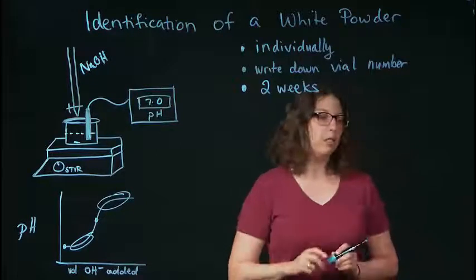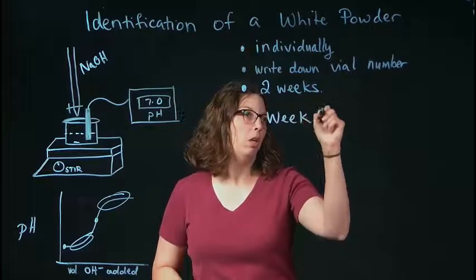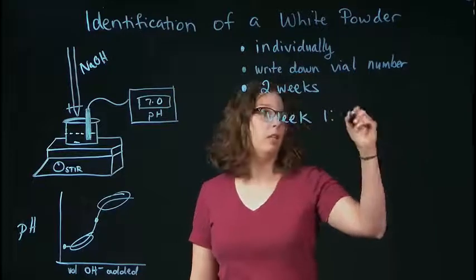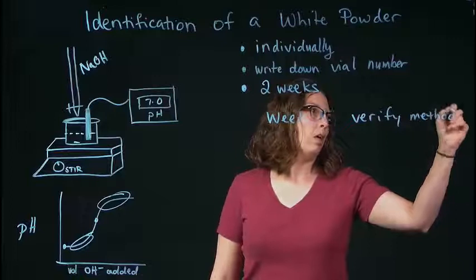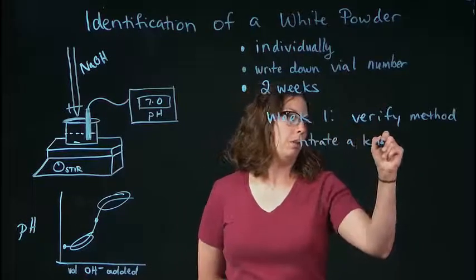So like I said, this is a 2-week lab. In week 1, you're going to make sure that you are performing your method correctly. So we're going to verify the method. And in doing so, we're going to titrate a known diprotic acid.